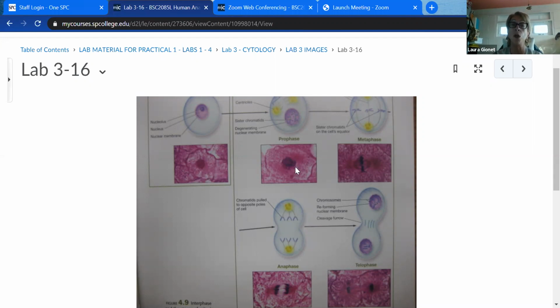In prophase, the nuclear membrane breaks apart, remember? And the chromosomes condense and coil, so when they become dense, they take up stain more, and that stain now looks much more dark than it did in a relaxed form. So over in this one, this one happens to be in pink stains, it would be like a medium color purple.